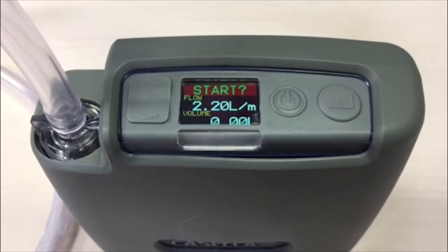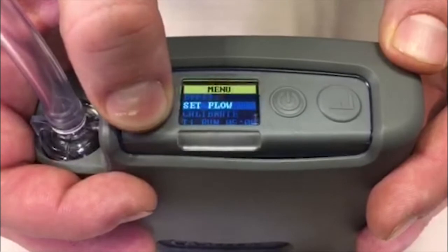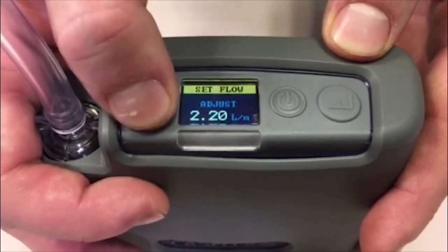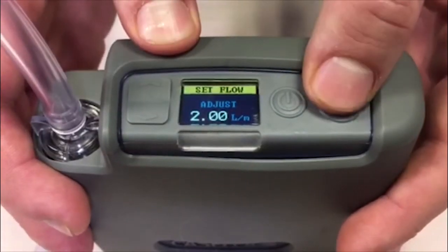To set the flow required on the pump, press the down cursor to access the menu. Select 'Set Flow' and set the desired flow rate. In this case it is 2 litres a minute for this inhalable sampling head.